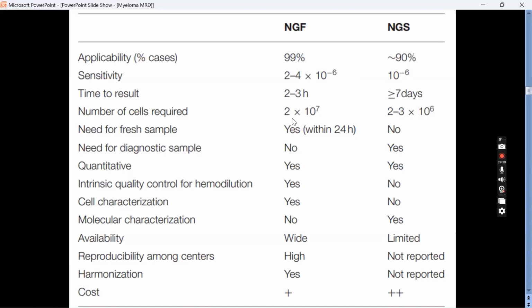Now, what do you think is the problem in acquiring a larger number of events? As I say, 5 million, 10 million. What is the problem you'll encounter? What are the difficulties? Yes, the amount of data we are generating. So to process those heavy files, we essentially need good software. Perfect. So that is the biggest problem, as rightly said.